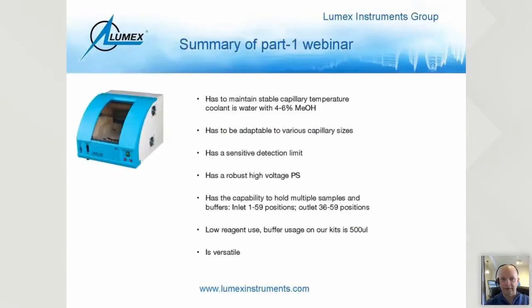So let's move on to the next one. All right. So as part of building a very simple but yet powerful capillary zone electrophoresis method, as you remember, I've actually listed all of these during part 1. We need a system that has to maintain stable capillary temperature, and we actually do that with a coolant pump, which contains water.